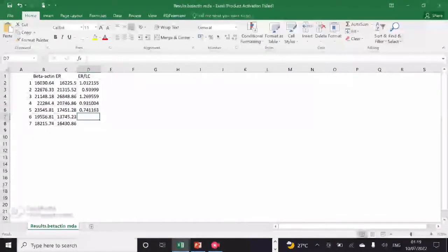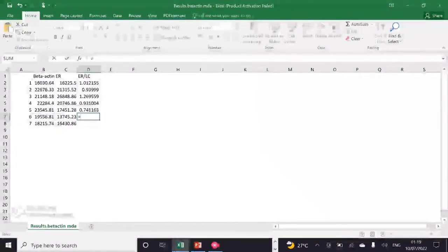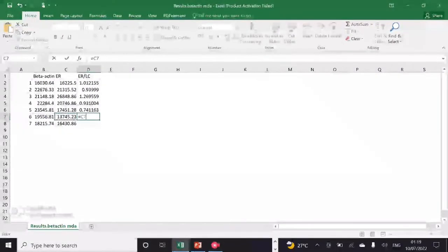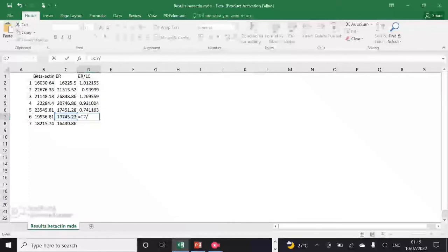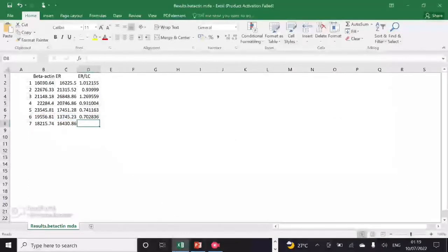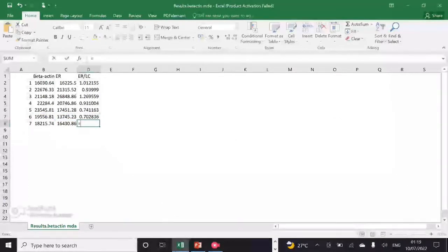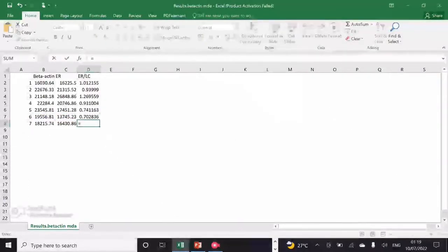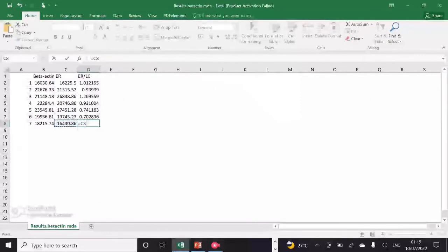For this, I will start dividing my protein of interest values with the loading control values. As you can see, I am dividing ER protein values with the loading control one by one.